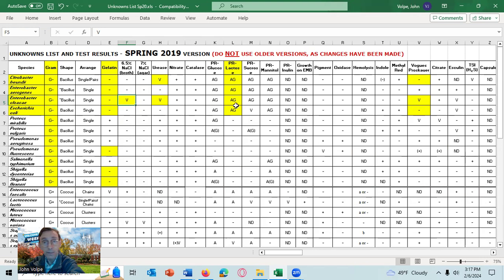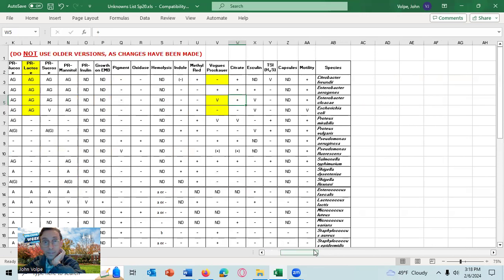And what would we do? That wouldn't be the best test because we expect it to be AG negative, AG positive, and it would be that. But if it is AG positive, that would still be that. So that wouldn't be the best test. This would narrow out 1, but not any of those 3. I don't see one that would narrow it down to just 1 here.